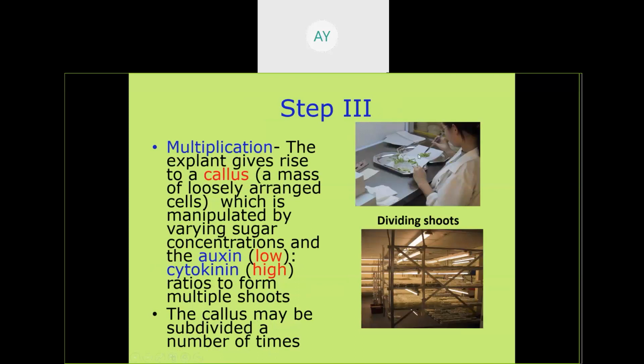मींस आफ्टर सिलेक्शन ऑफ द एक्सप्लांट, they are going to put the explant in the suitable media inside the laminar air flow, inside the laminar after transferring. Means इसको कहते हैं incubation. Means putting the explant in the plant tissue culture media that is present inside the jam bottle, and we cover it. ठीक है ना, उसको कवर करते हैं और कंप्लीटली सेलोटेप की तरह आता है, पैराफिन से मेम्ब्रेन से उसको कंप्लीटली क्लोज कर देते हैं, सो दैट फ्रॉम द एक्सटर्नल साइड देयर इज नो चांस ऑफ इन्फेक्शन. तो आपको ये नहीं होना चाहिए कि यहाँ पे चांस ऑफ इन्फेक्शन हो.